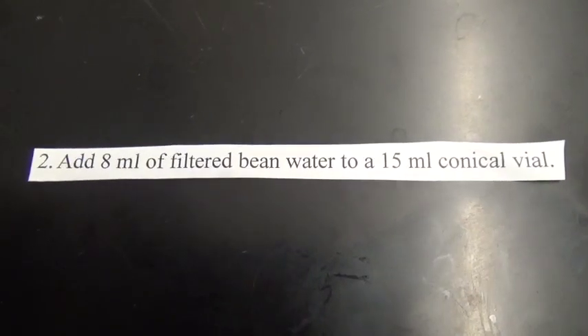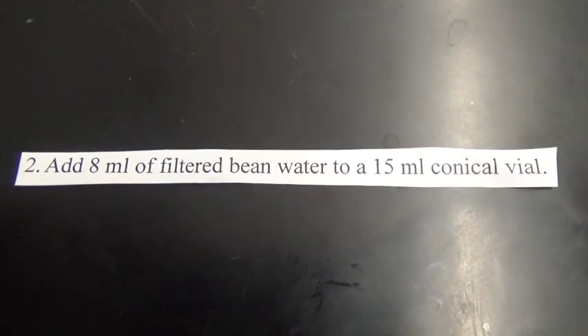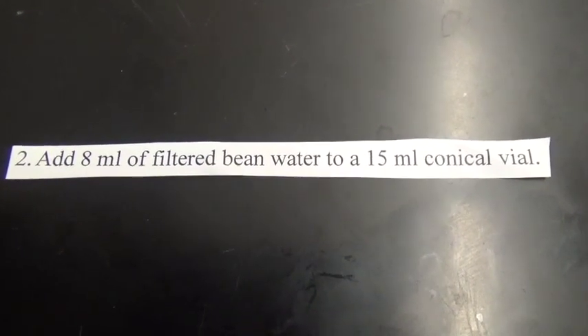Number two. Add eight milliliters of filtered bean water to a 15 milliliter conical vial.